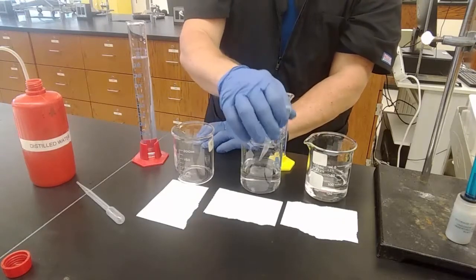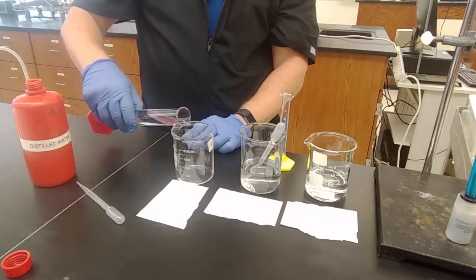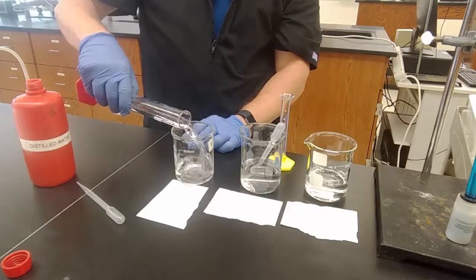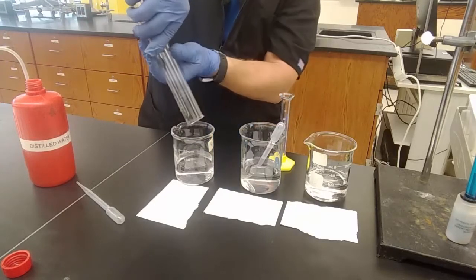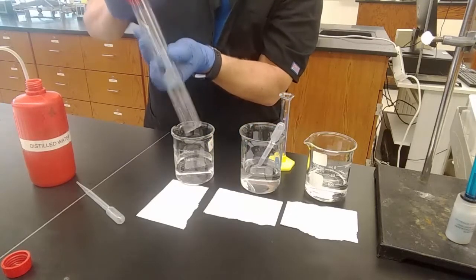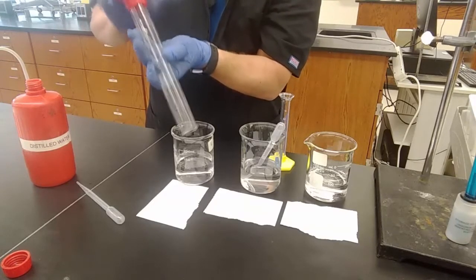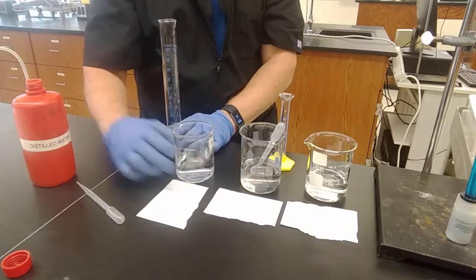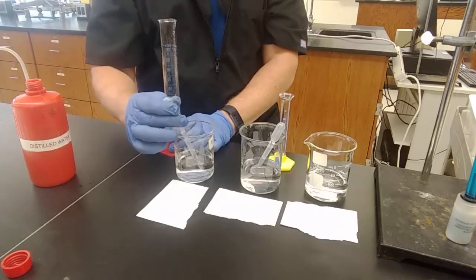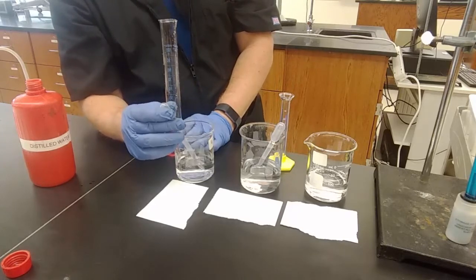I'm going to leave this pipette in beaker number 1, and I'm going to pour the 100 milliliter solution. These things contain rather than deliver, but we're discounting that as well. And stir. Just have my deionized water in it, so I'm going to use it to make number 3. Mix really well.